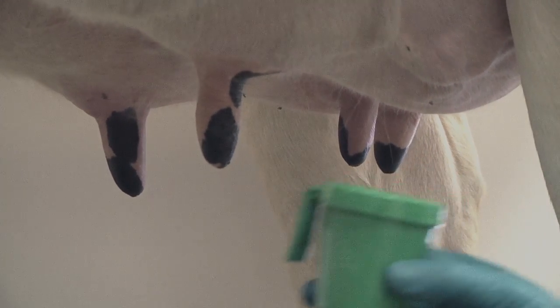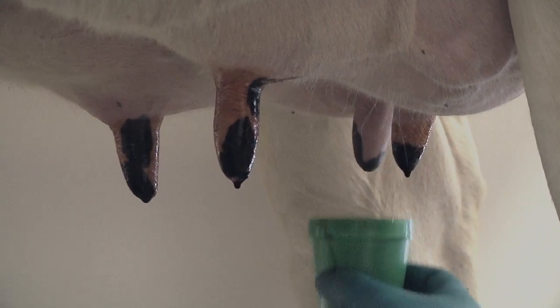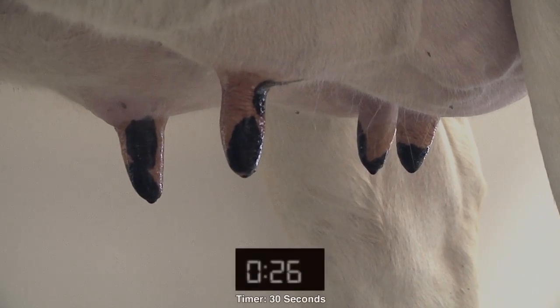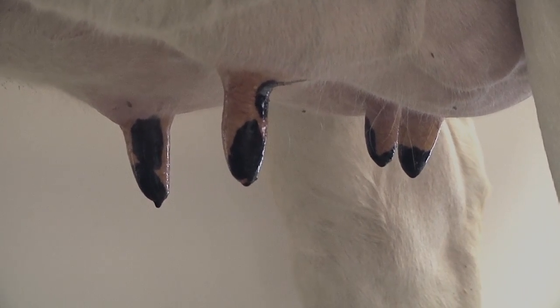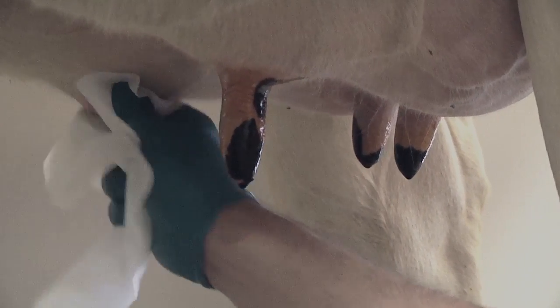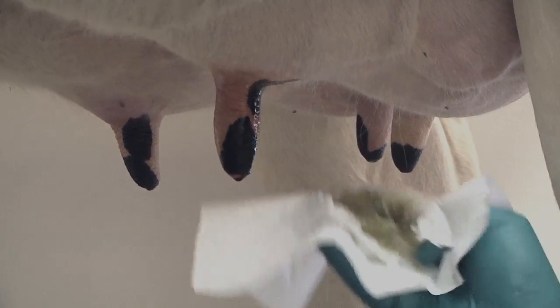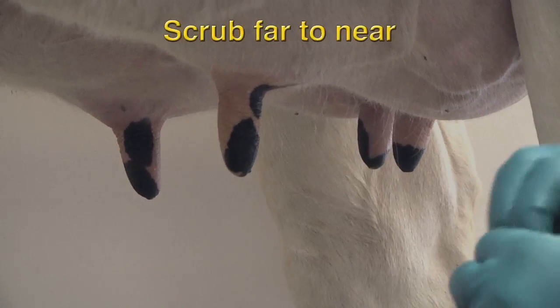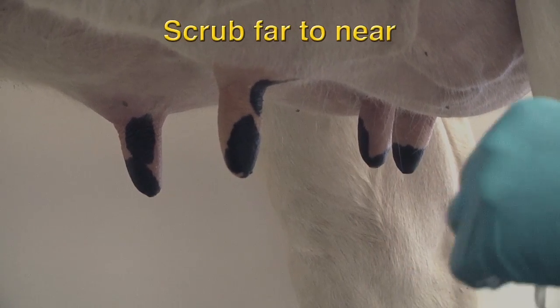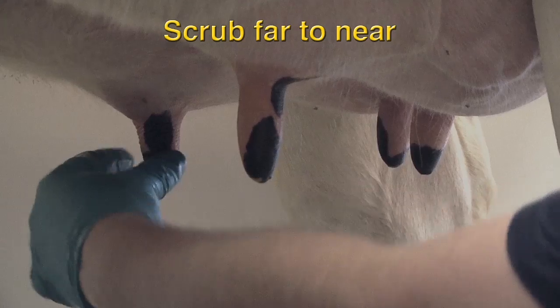Pre-sanitize the entire skin of all four teats using a pre-milking teat dip and allow at least 30 seconds of contact time. Wipe the teats dry with a clean paper or cloth towel. Using an alcohol-soaked gauze or swab, scrub each teat end, working from the furthest teat to the nearest to prevent contaminating a clean teat with the operator's hand or arm.